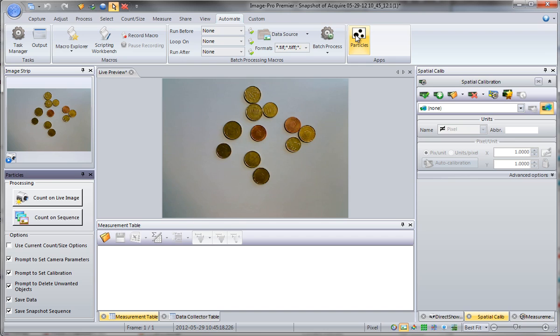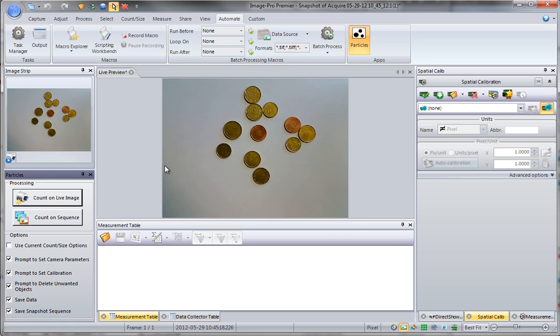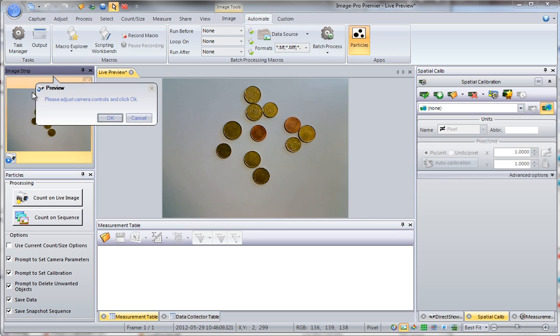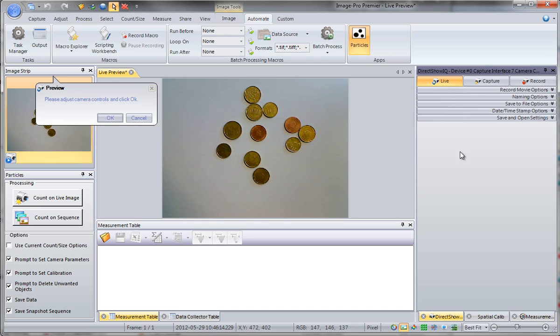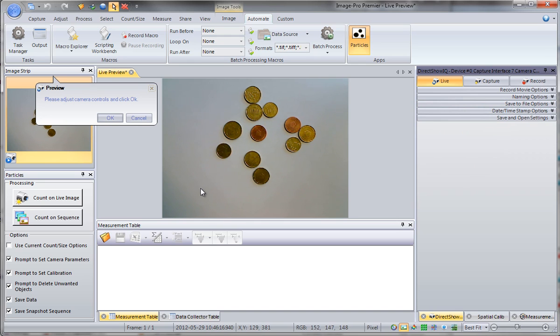To count objects on a live image, simply click the 'Count Live Image' button. You'll see a prompt which asks to close all images. The next prompt will show you that you can adjust parameters of the capture. If you are happy with that, click OK.